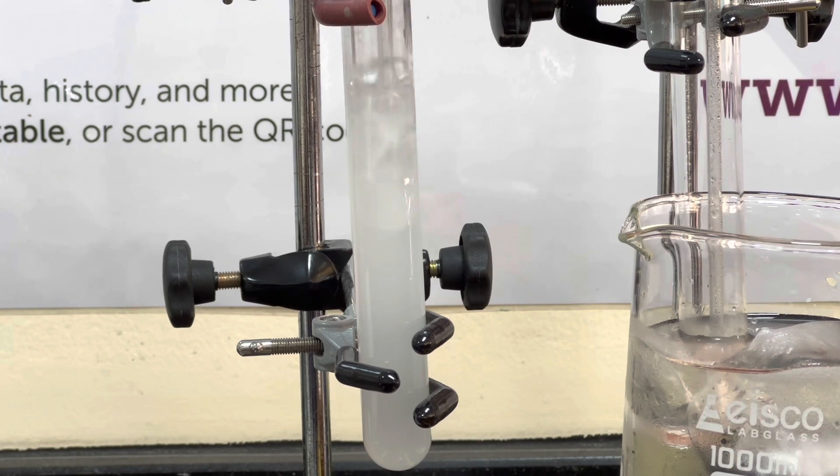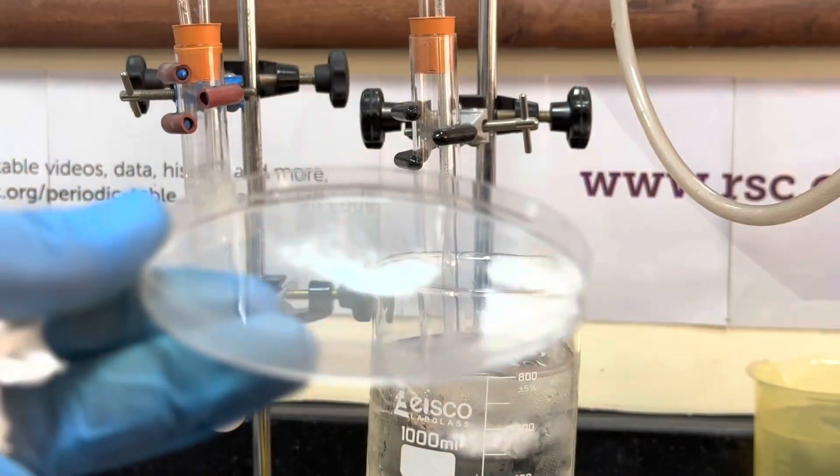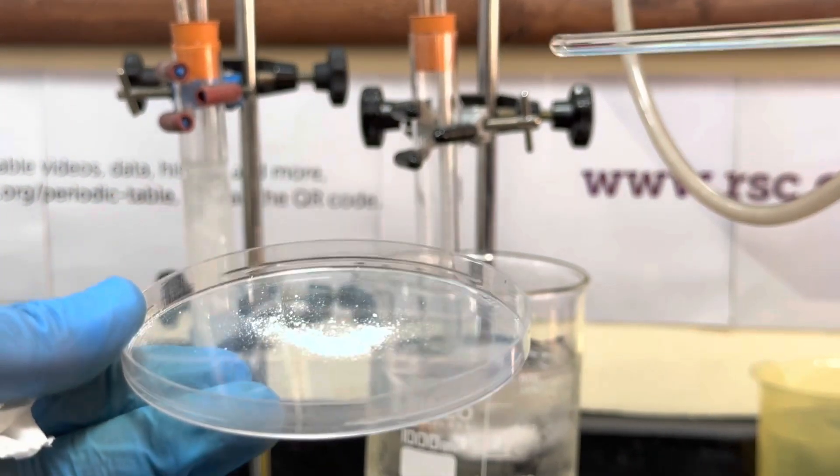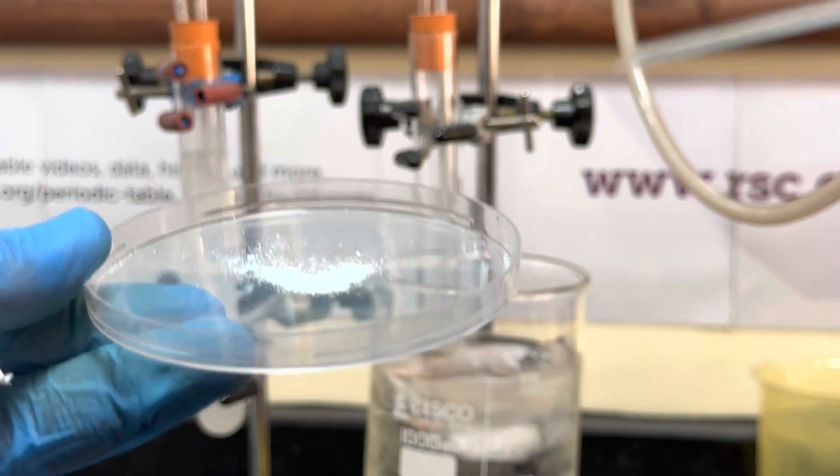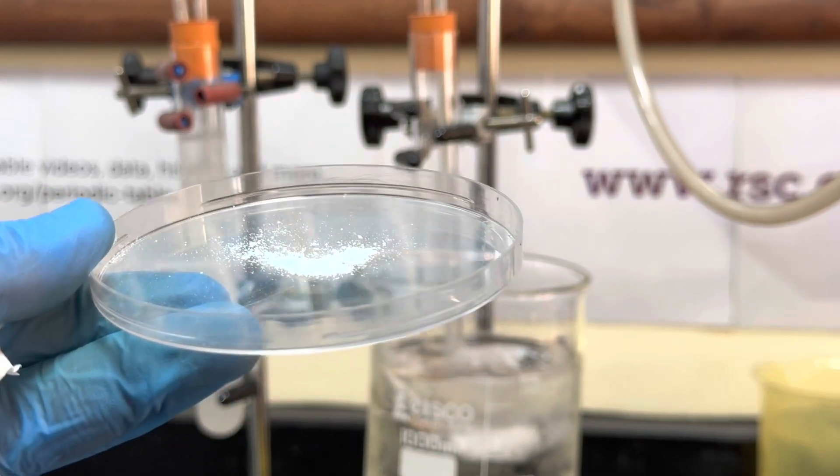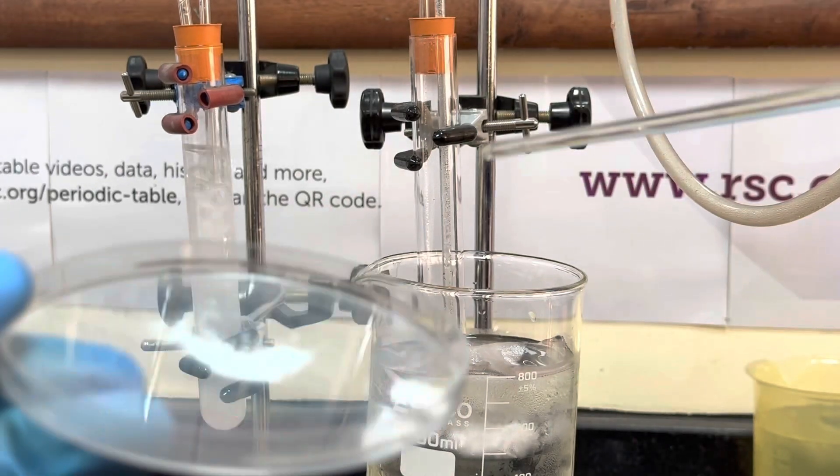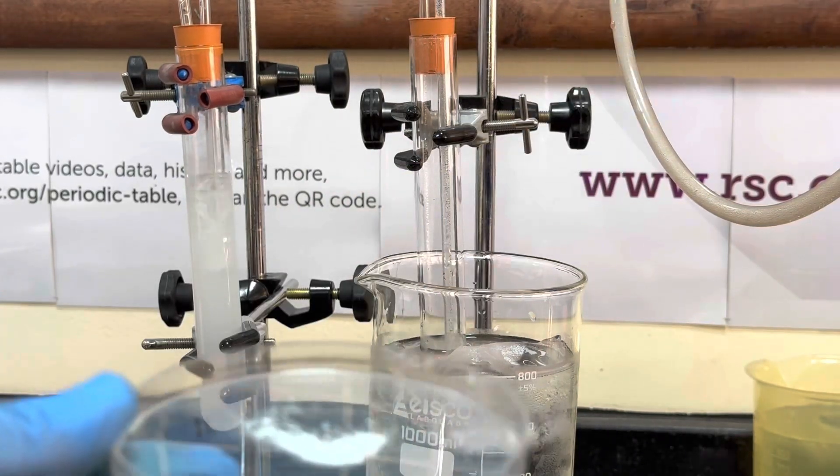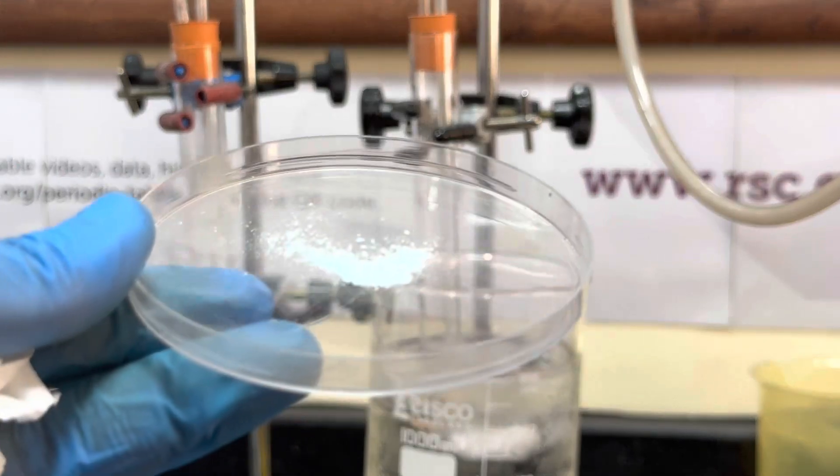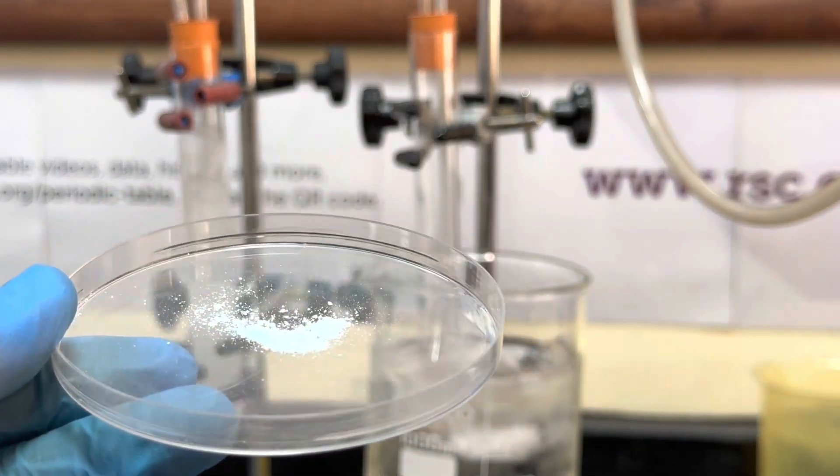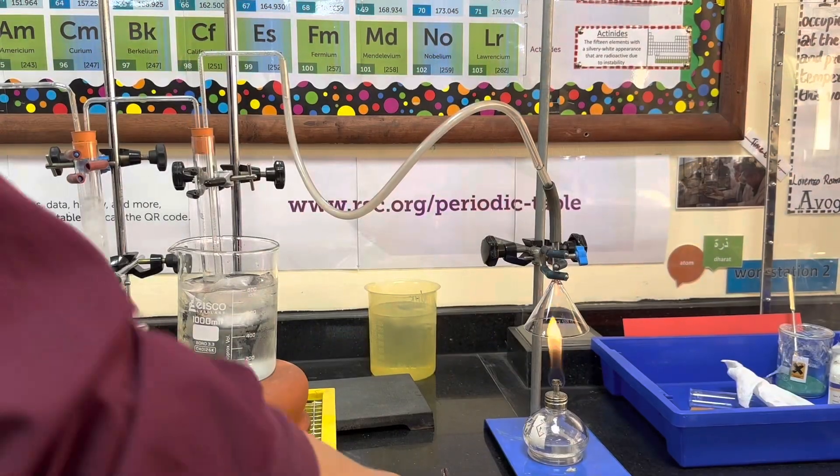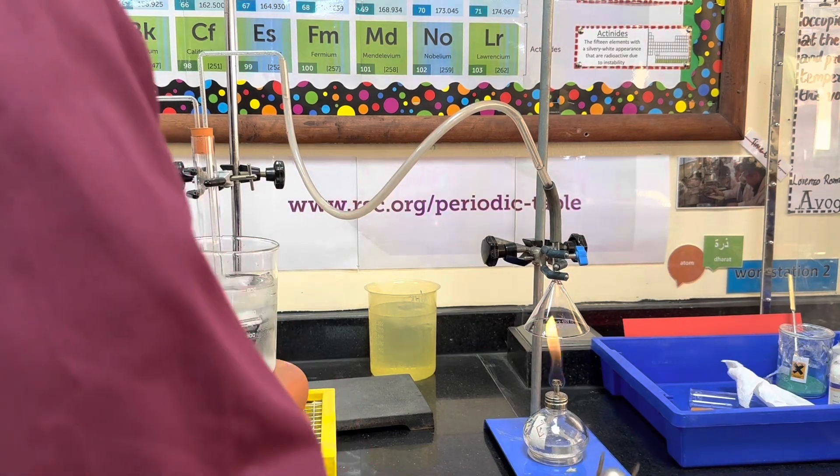So here, in advance, I have prepared some anhydrous copper(II) sulfate. It's quite easy to prepare - you just use a hot plate and crush up some hydrated copper sulfate, place it in a dish like a crystallizing dish, and evaporate the water away.